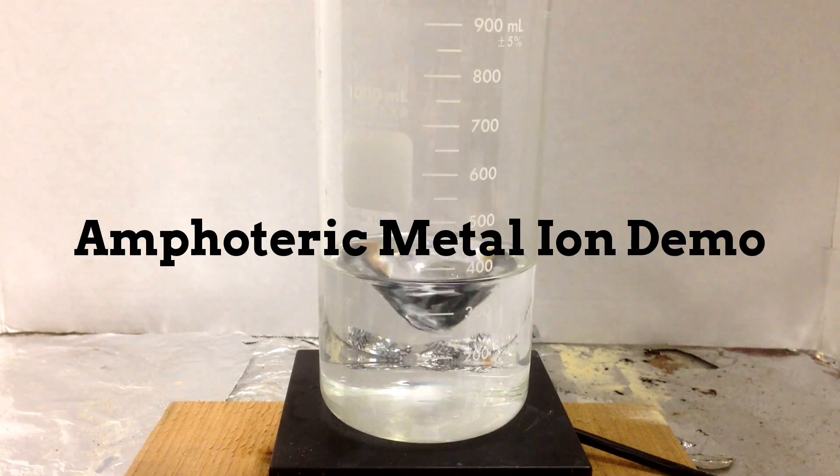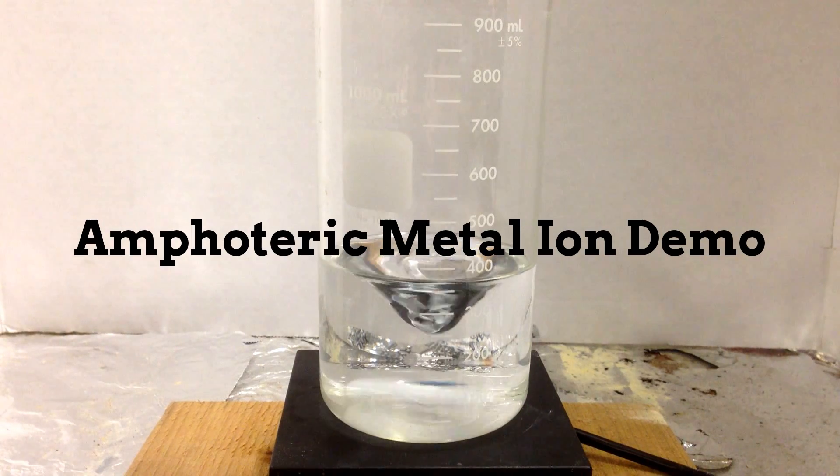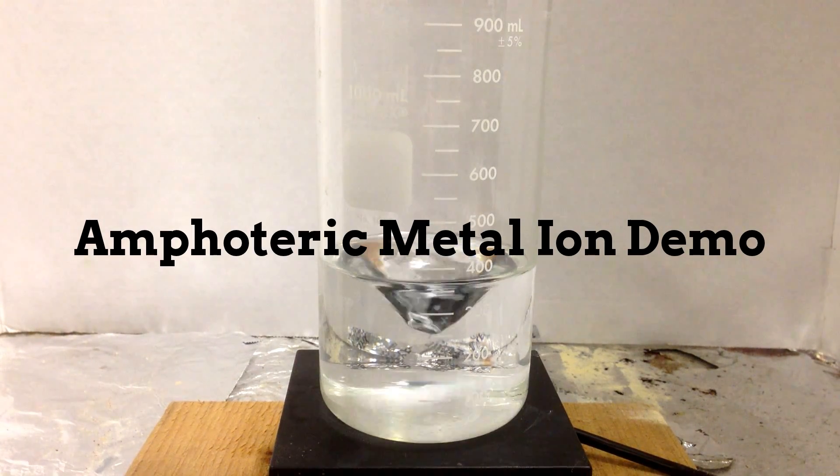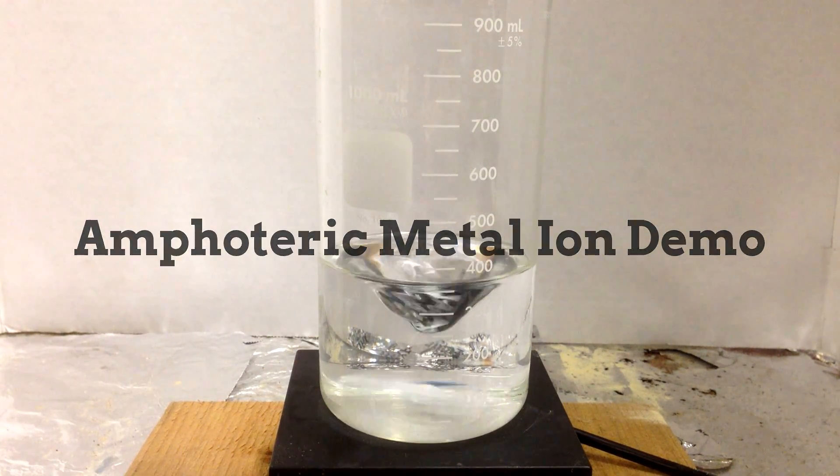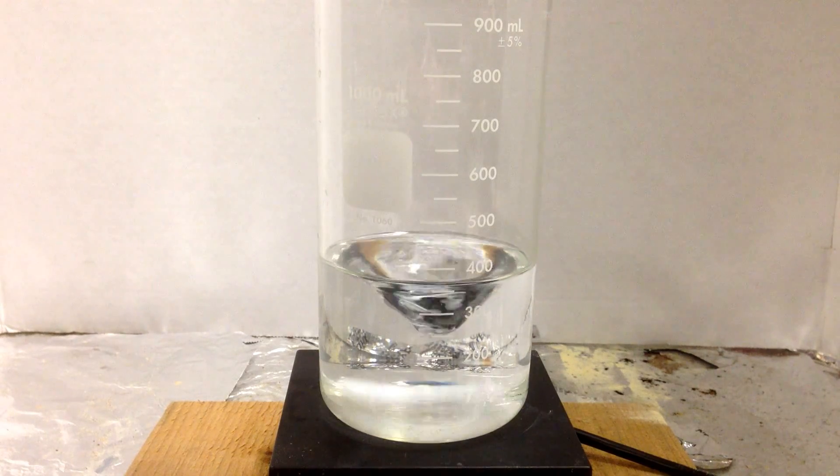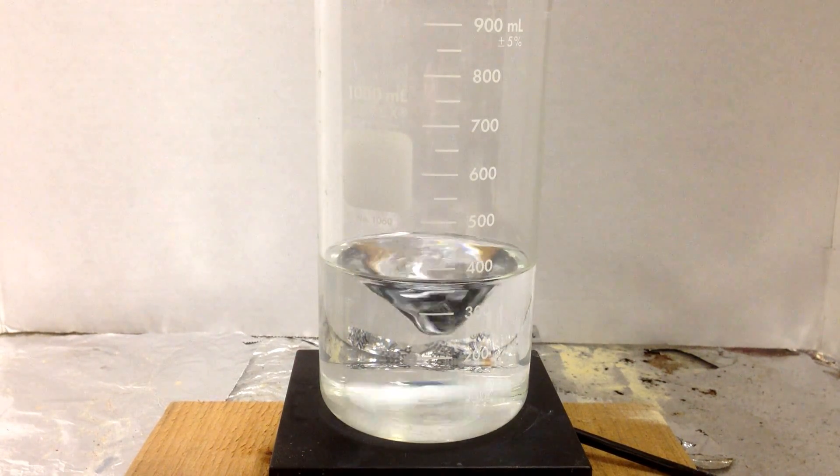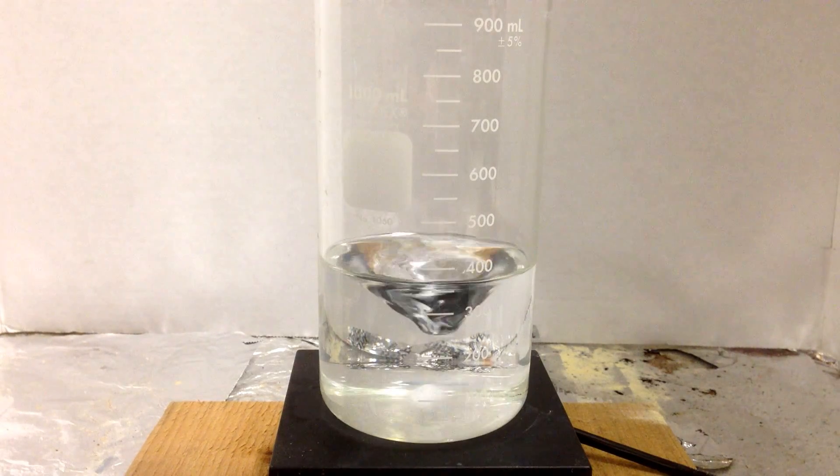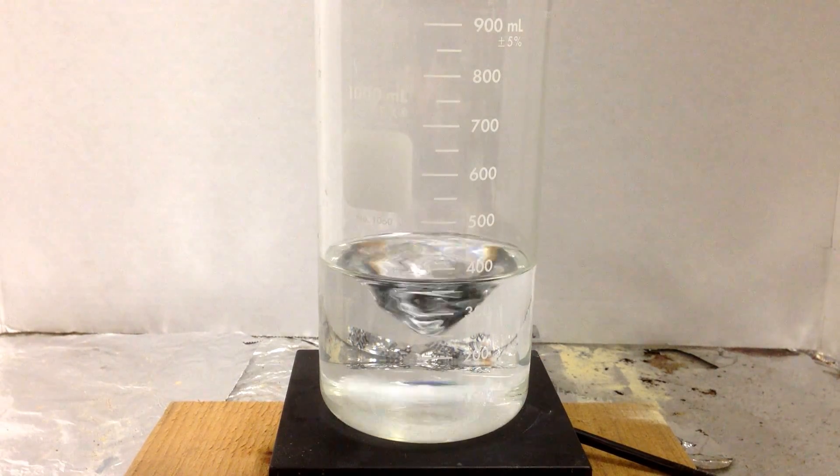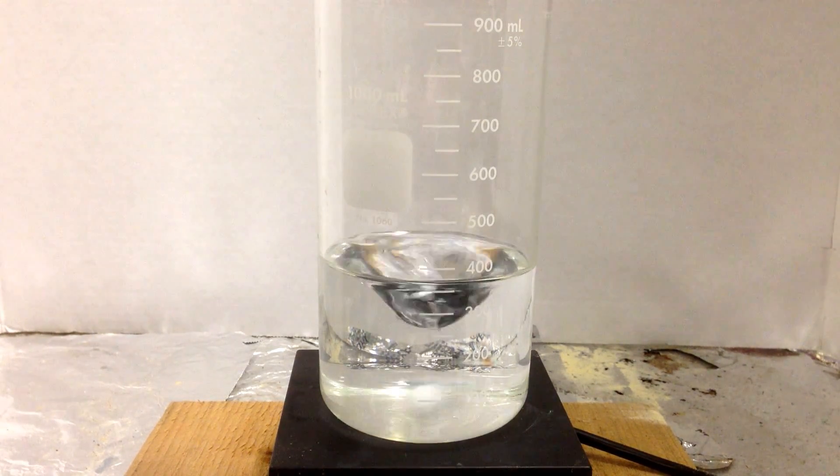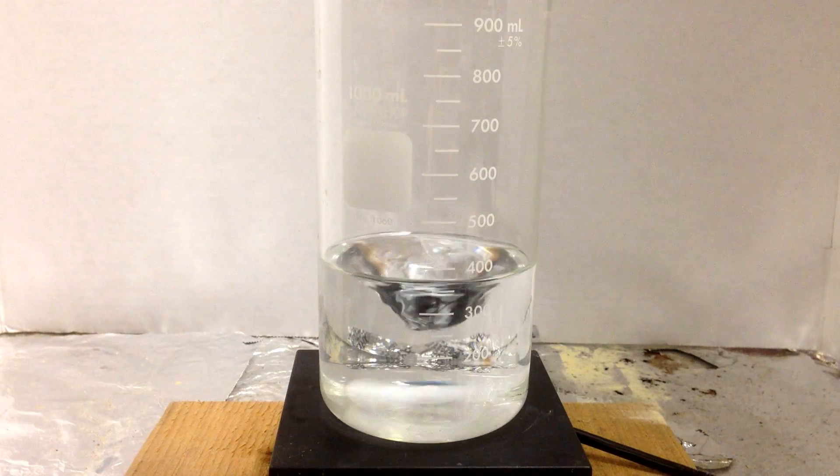This is a demonstration of amphoteric metal ions. There's only a few metals that, when they become ions, exhibit amphoteric properties, the ability to act as an acid or a base, or be affected by an acid and or a base. They include lead plus two, aluminum plus three, chromium plus three, and zinc plus two.